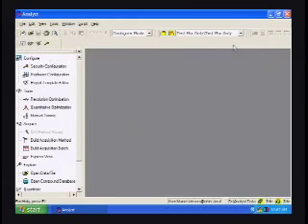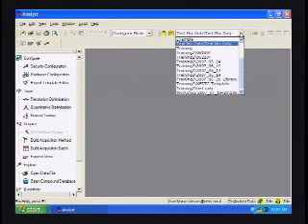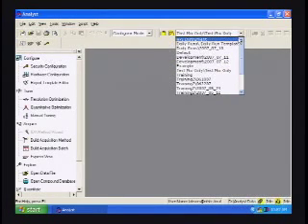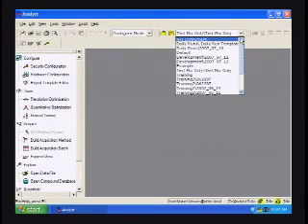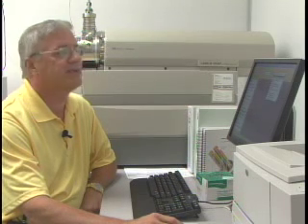One of the important features is right here — the use of project folders. The project folders are individual folders that can be custom named for individual projects. It's important to note that in each of these project folders, the necessary method files and quantitation files need to be present for any experiment that is performed while in that project folder.